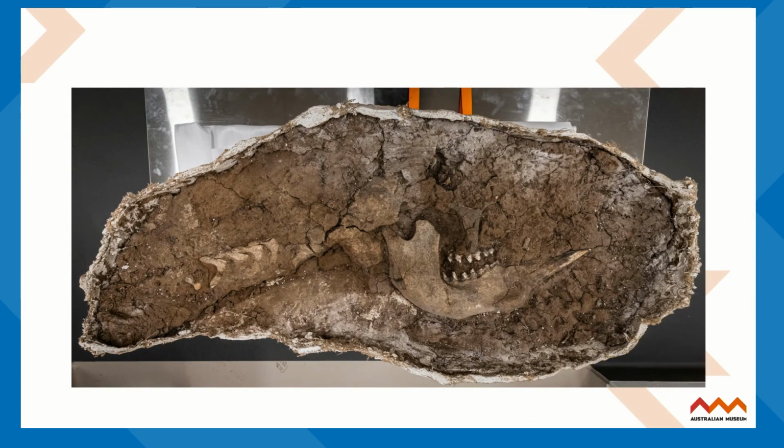Unfortunately, the site where the fossil sat was driven over before Darren was found, so there is some damage to the bones. The extent of this damage is unknown, so we have to be very careful when removing the surrounding soil, as there could be broken pieces amongst the soil that we need to keep. The back of the skull appears to be extensively damaged and caved in, so we will most likely resort to sieving the soil matrix as we work in that area to recover the bone fragments.